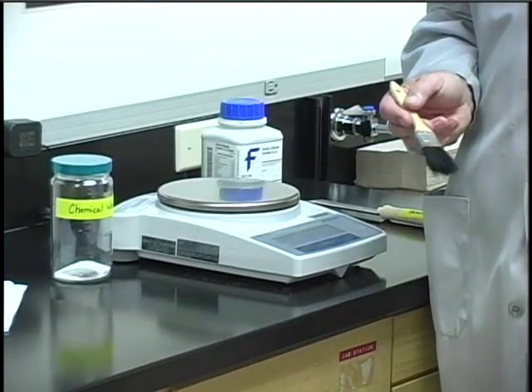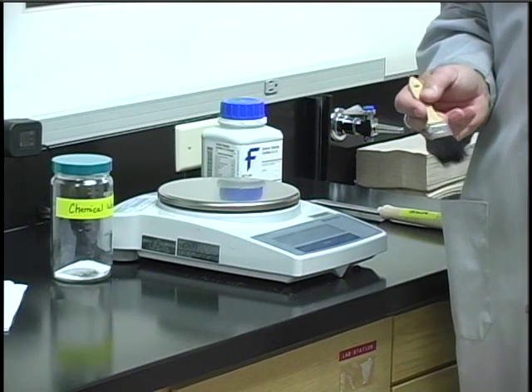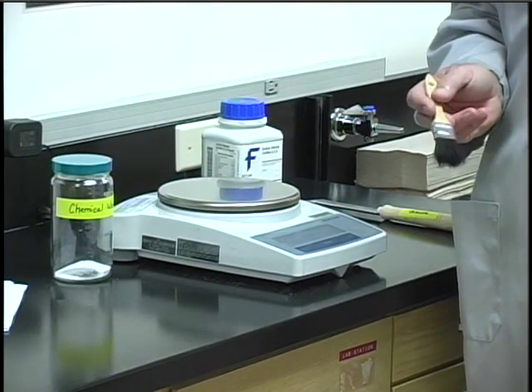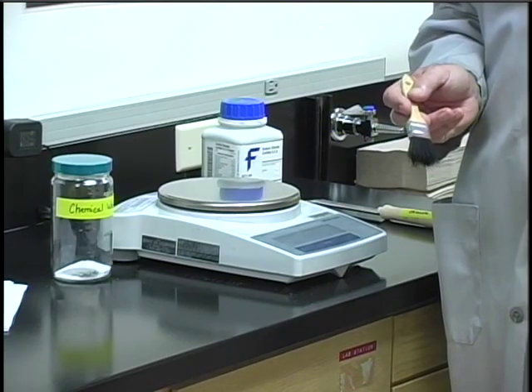You shouldn't be embarrassed if you have a spill — it happens to everybody. But you should notify the instructor about any accident or spill so that we can make sure everything is taken care of properly.